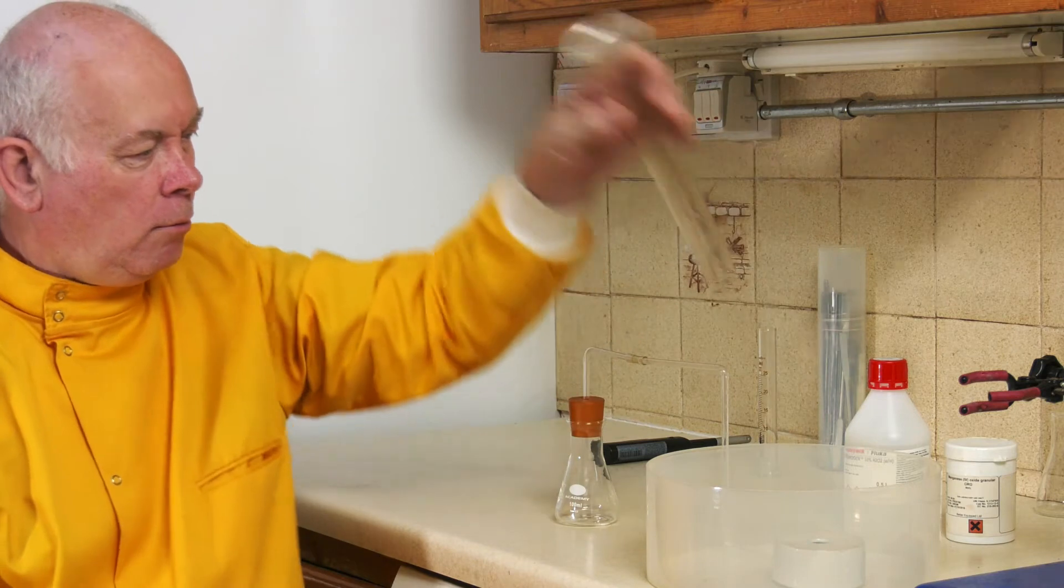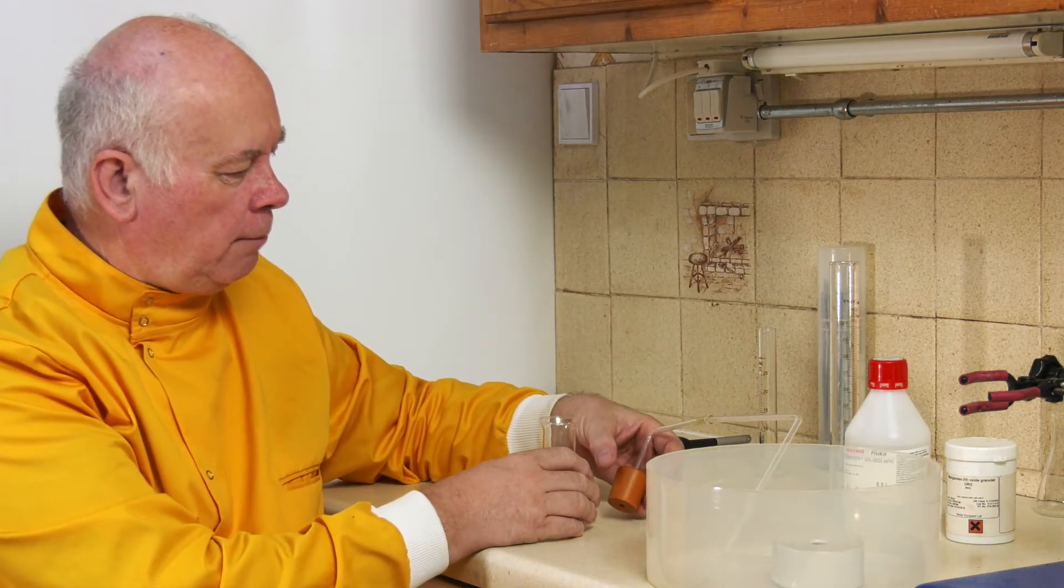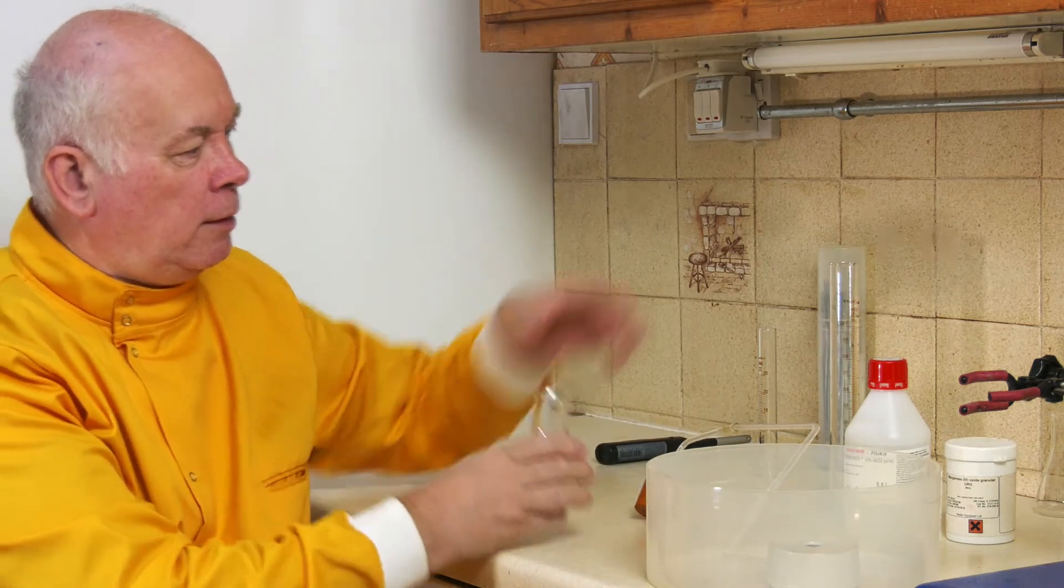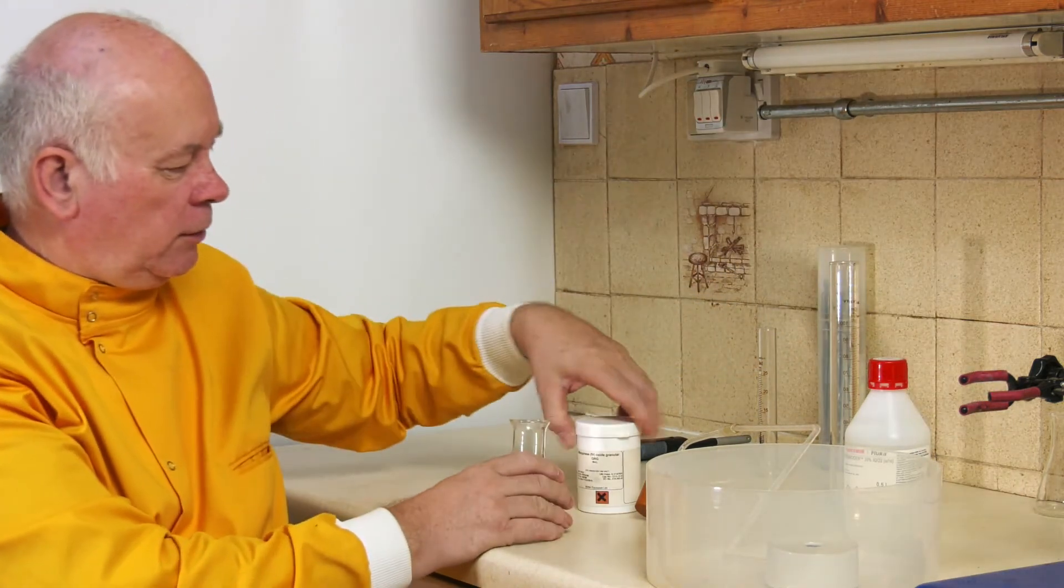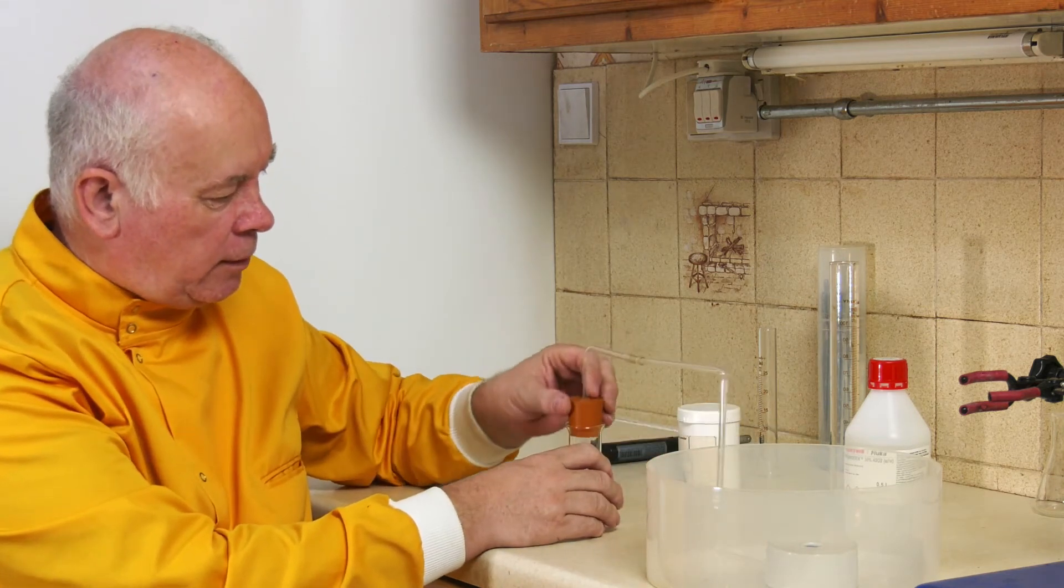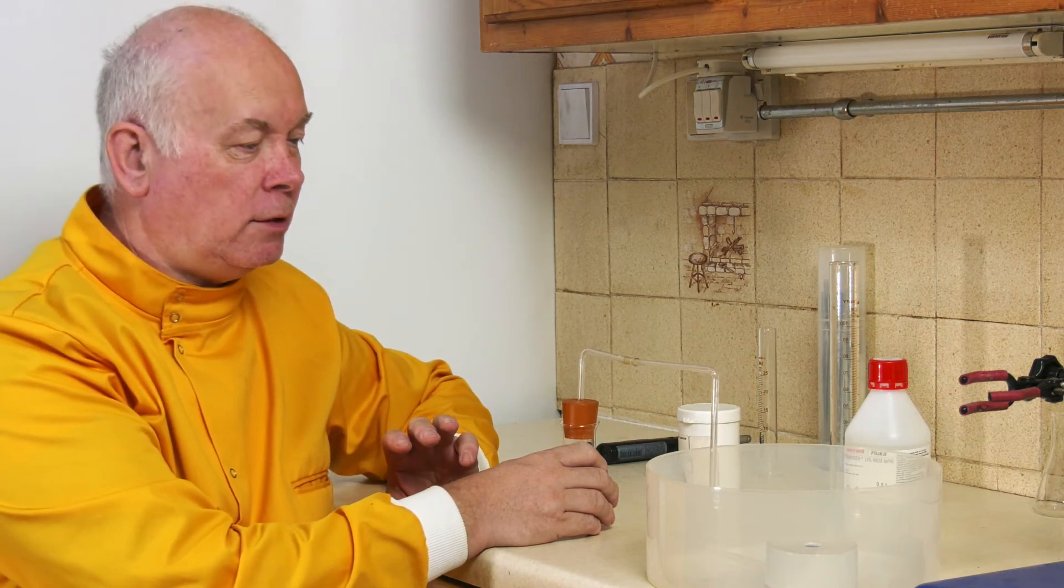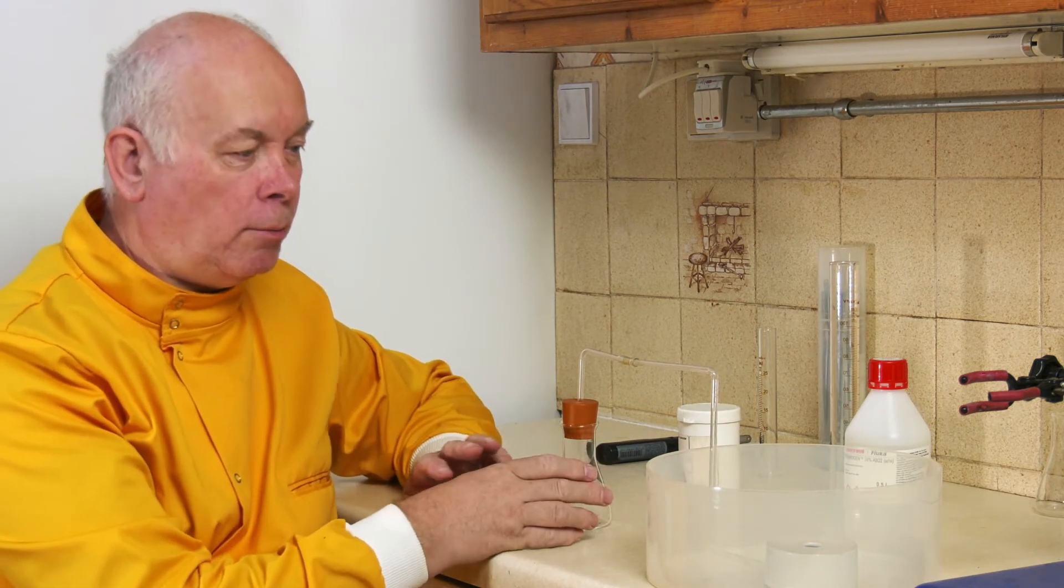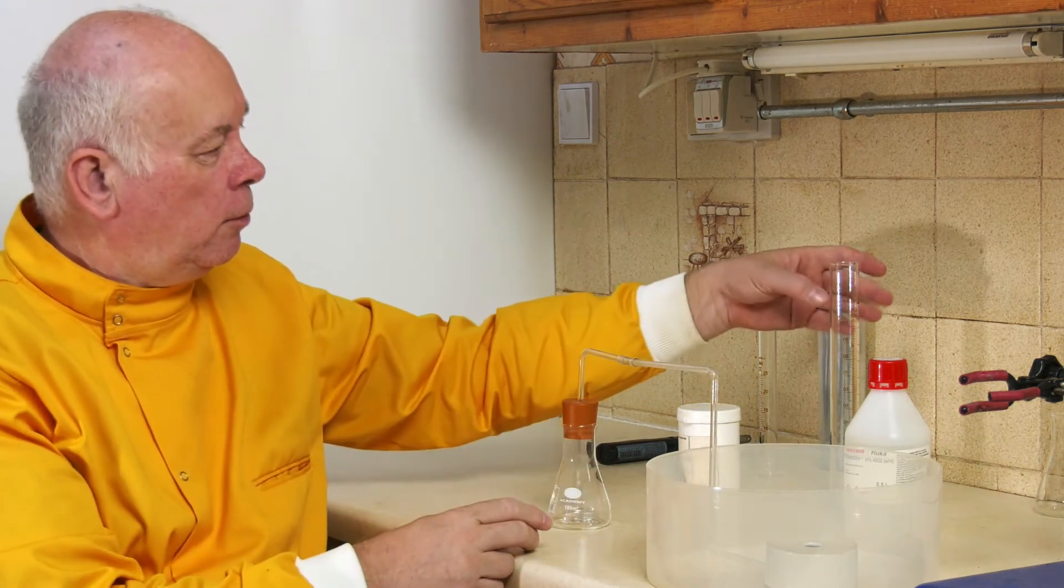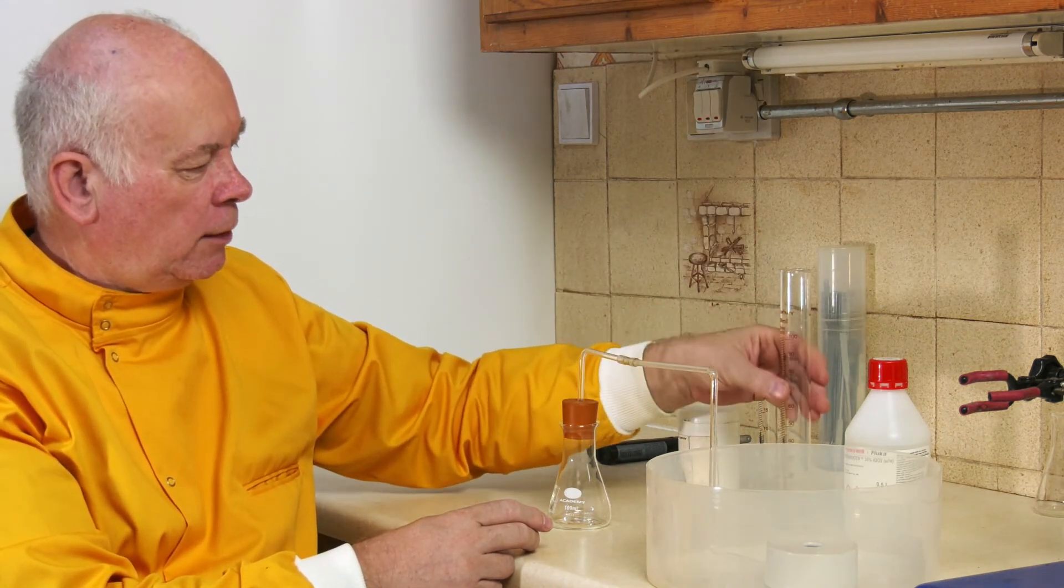And then when we're ready, what we'll do is put a small amount of the manganese dioxide catalyst in here, very quickly place this bung over the top making an airtight seal, we'll start the stopwatch, and we will measure the amount of oxygen collected every few seconds. Let's set it up now.